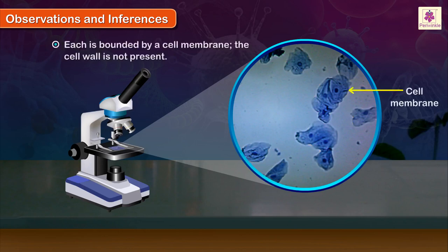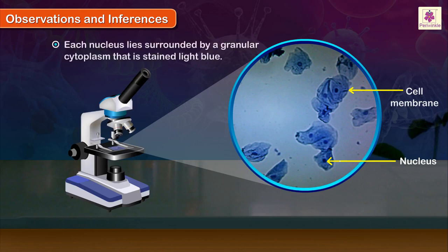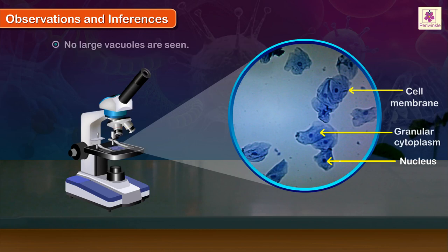Each is bounded by a cell membrane. The cell wall is not present. Each cell has a spherical nucleus, stained dark blue in color. Each nucleus lies surrounded by a granular cytoplasm that is stained light blue. No large vacuoles are seen.